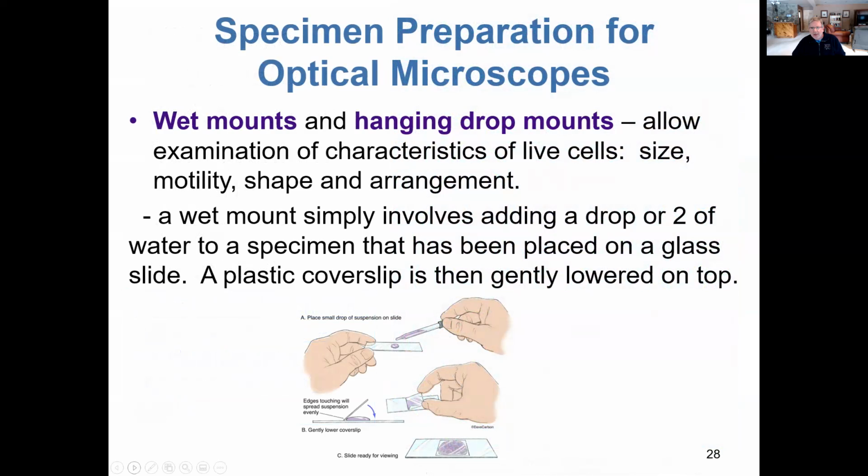In lab coming up, we're going to also be performing stains on some algae. And we're going to be utilizing what's called a wet mount, making our own wet mount. So this is a common technique that one can use to look at leaves under the microscope.